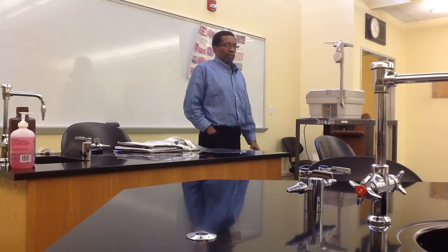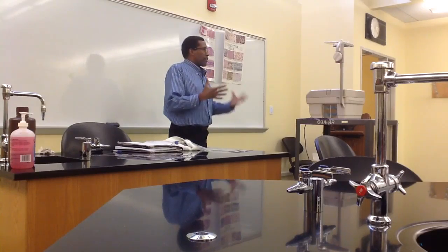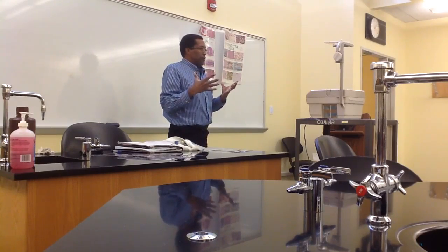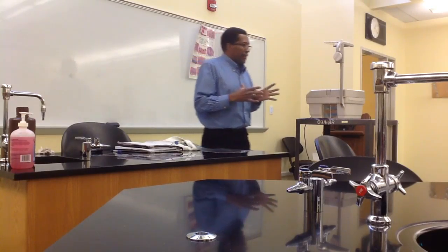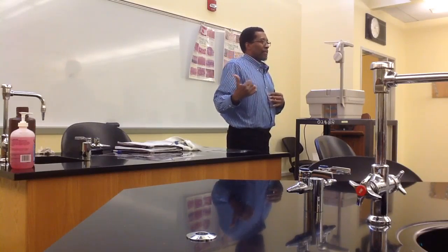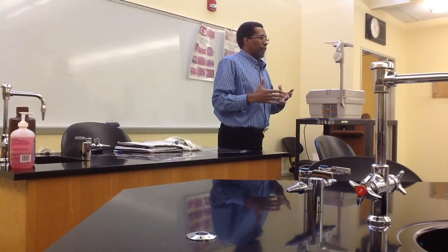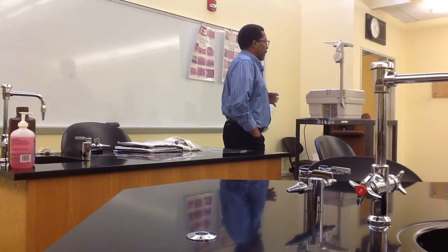Today we're going to continue on by considering types of connective tissues and types of muscle tissues. Okay? Now, if you have a system of elimination, it's going to help you narrow down a particular slide or tissue that you're looking at. The key to narrowing things down will be how do you eliminate what the tissue that you're looking at is not. Okay, so we're going to use that approach. And the key thing will be to look at what to compare.